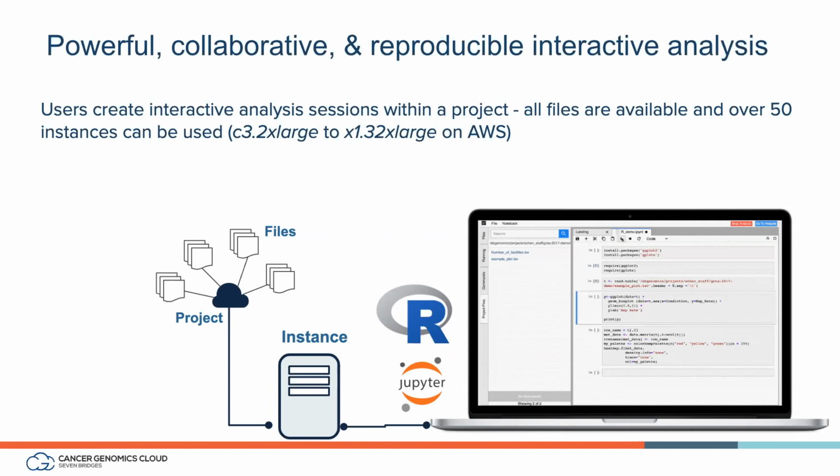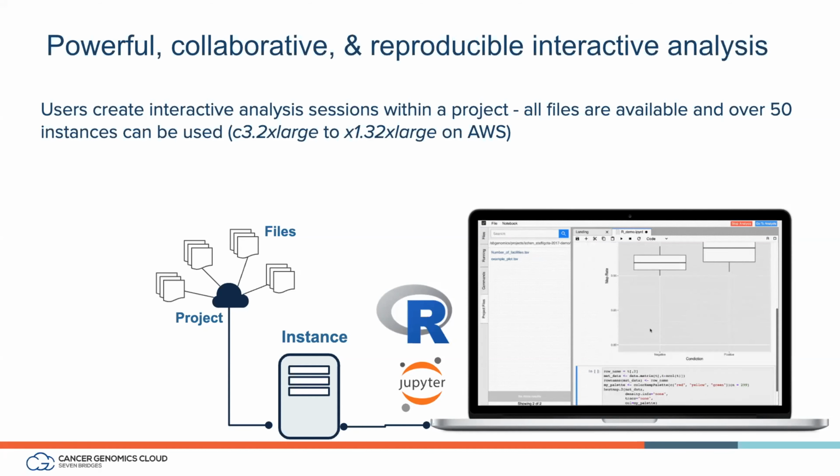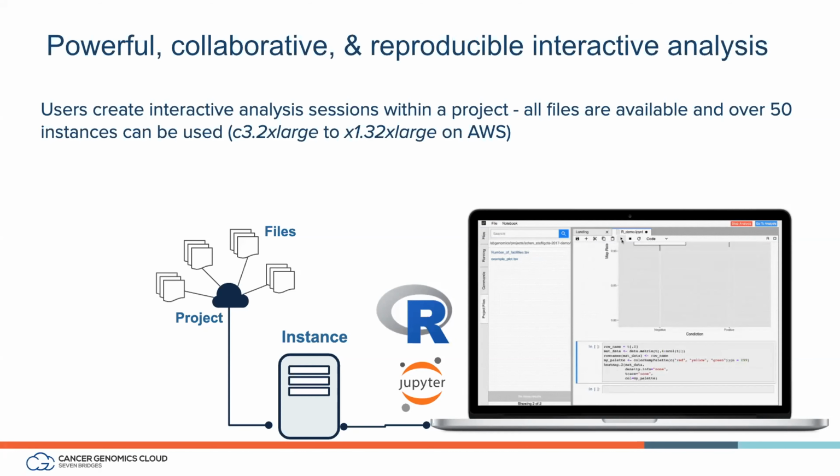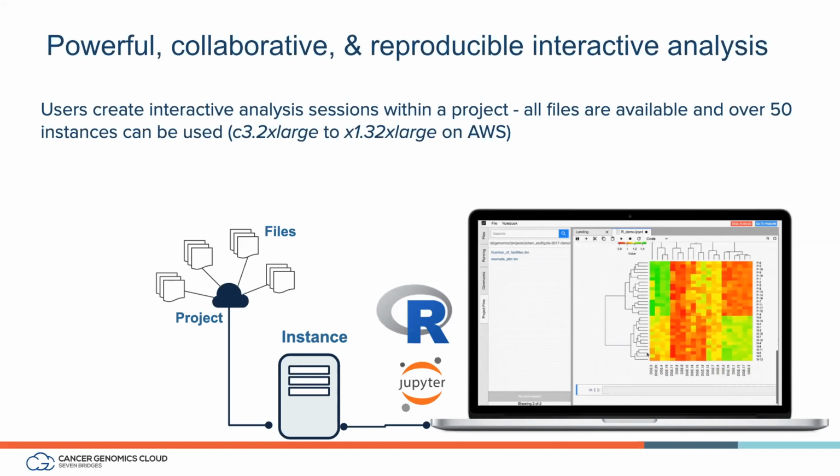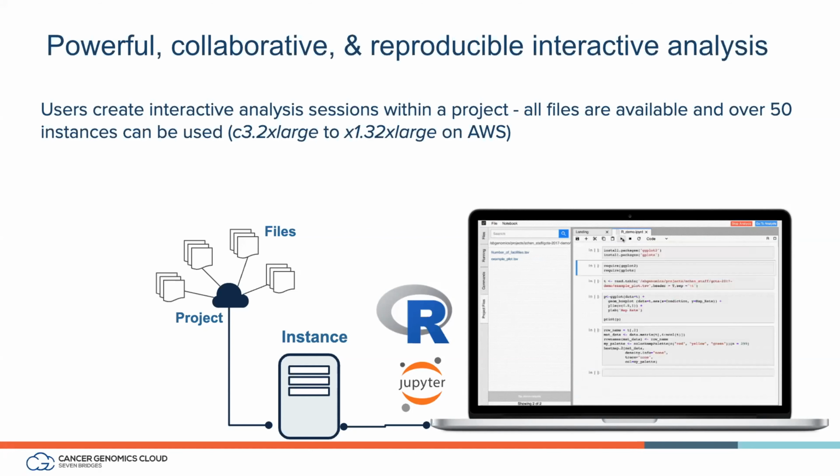You don't have to download them and then run them locally. You can keep everything in the cloud. We have a number of different computational resources to choose from when running these types of workflows. And you can use it exactly like you would use it locally. So this is also a really nice feature to go from an analysis like, let's say, gene expression to something more like making PCA plots and so on.